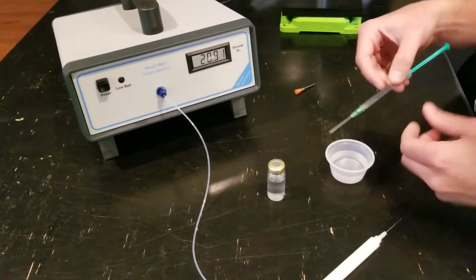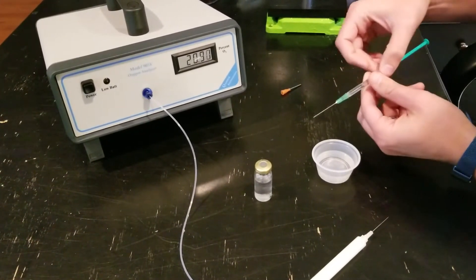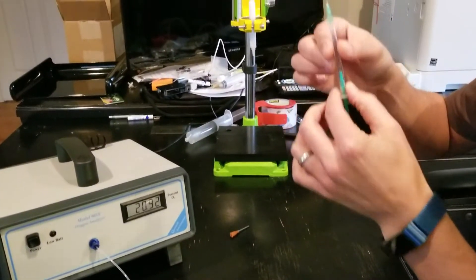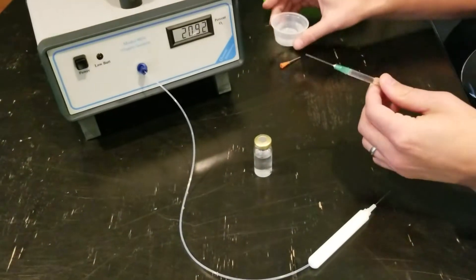The first thing I'm going to do is fill this one cc syringe with water. You want to be extra careful that there are no air bubbles so that you don't contaminate the sample.